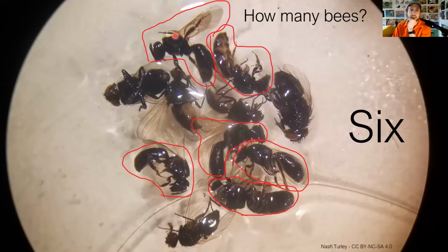I believe they're probably all little Lasioglossum sweat bees, and they're all mixed in among these flies. And this one's a bit obscured, but that's one as well. So it's a little tricky. Imagine if this was with lots more bugs around. And that's why we move them one at a time through, because when they're all clustered together, it makes it a lot harder.